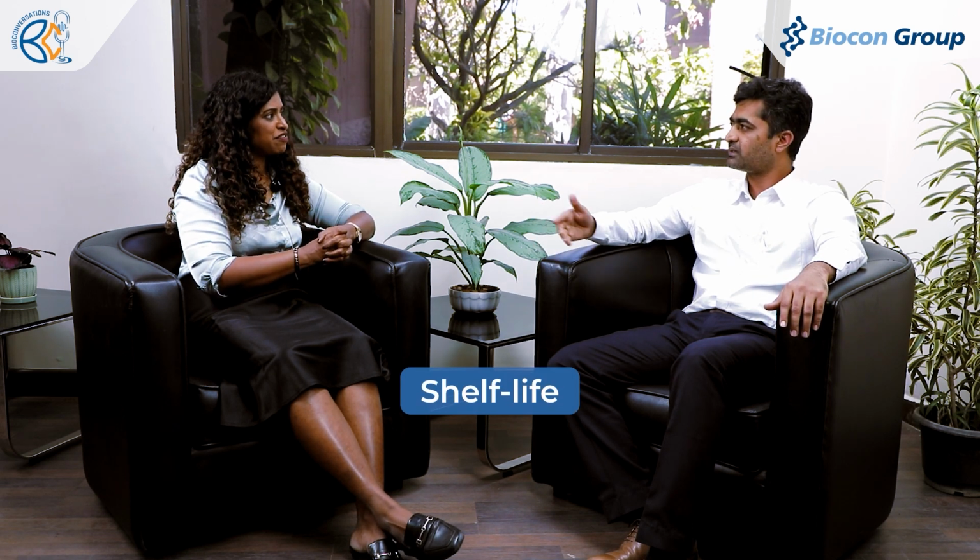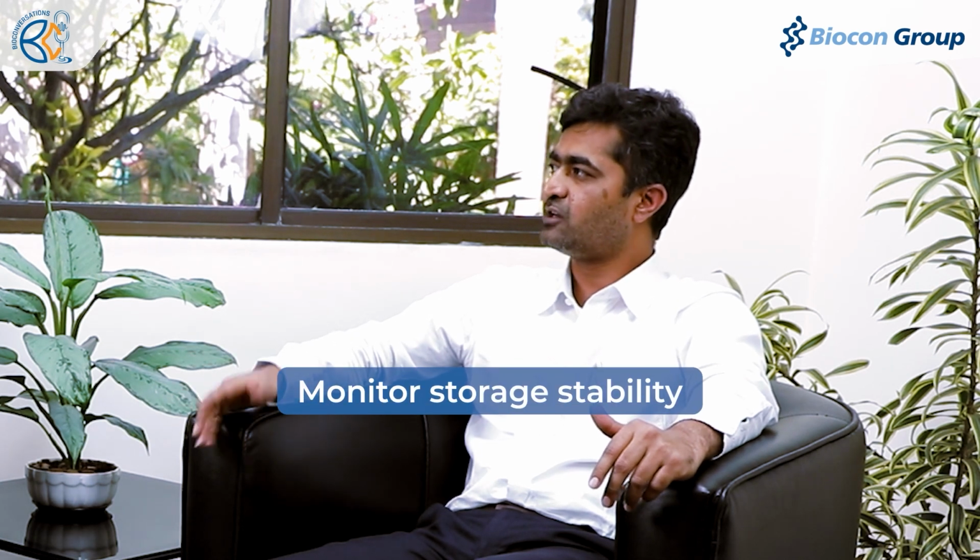Right. So this is one thing, and then they are stored for several years, as I said. Is there a shelf life we're looking at? So they are ideally immortal, so they can be stored. In that way, cell bank storage stability also has to be continuously monitored. And in addition to that, there could be something unforeseen, so we'll have to take care of the risk.